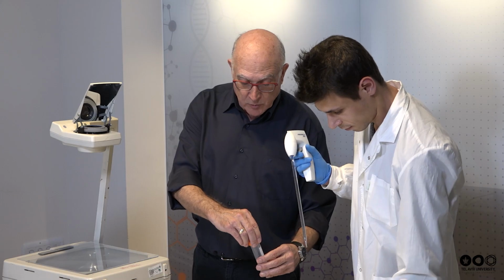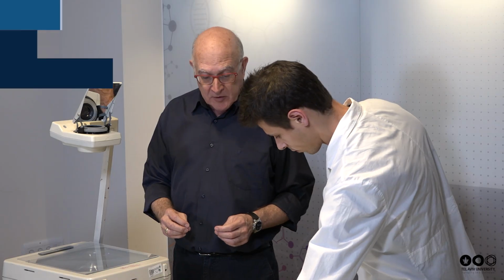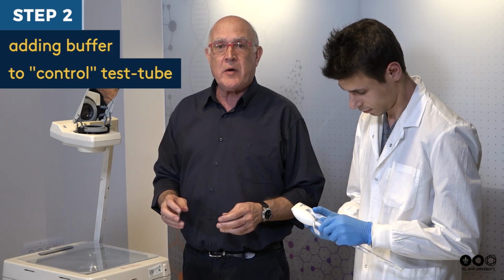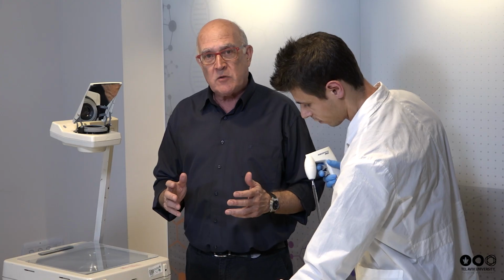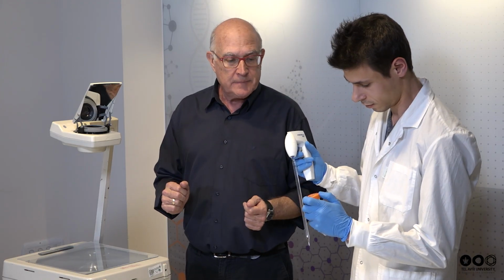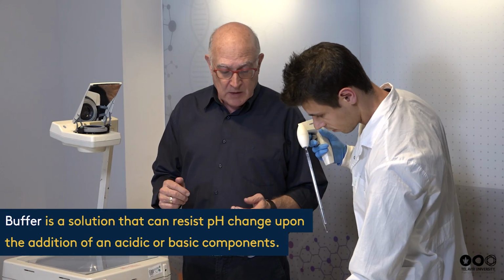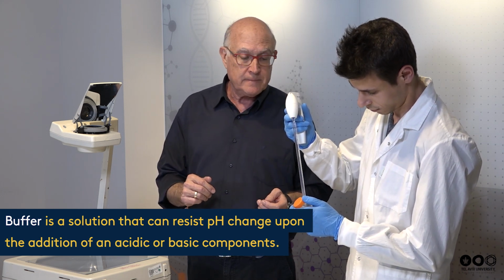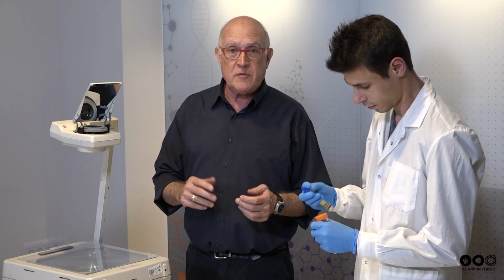Good. So to 1 test tube, add some buffer and label the test tube C for control. Controls are necessary in all experiments, and it is those controls that we compare to with the experimental. In this case, the control is just buffer, and we're going to see that buffer, in essence, doesn't do much to bacteria at all. Mark it C for control.